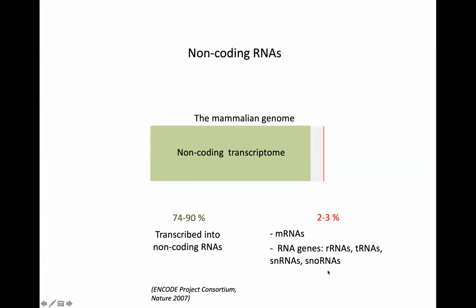Moreover, some of these RNAs are usually of smaller size. They're shorter than their longer counterparts. And this generates a number of challenges because we're not really sure whether these RNAs are identified with the standard direct RNA-seq protocol, although we do assume that this may not be possible, because if they don't have a poly-A tail, we don't really expect this adapter to ligate there.